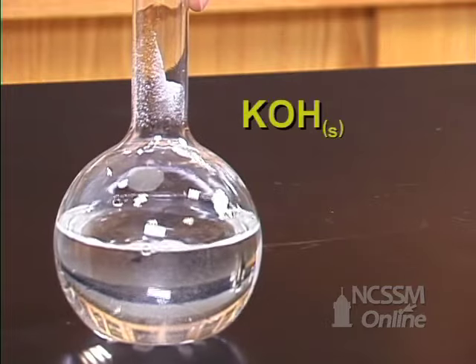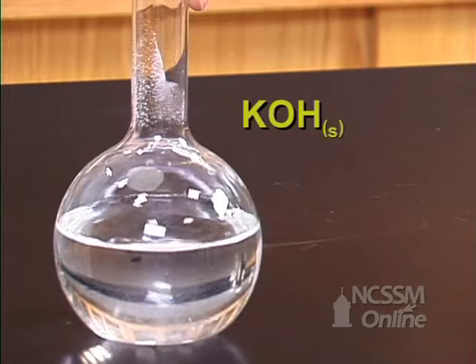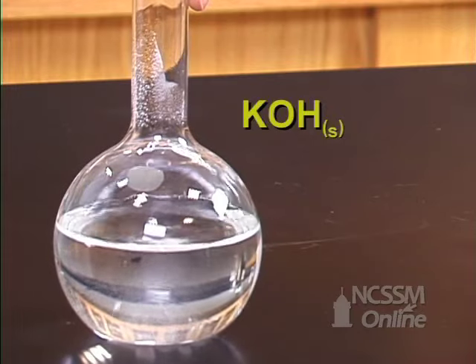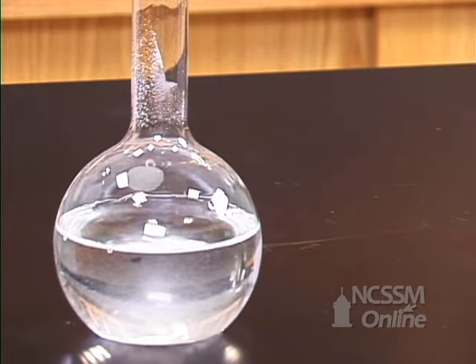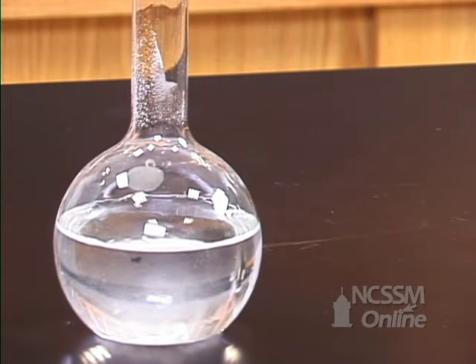If I add some potassium hydroxide, the potassium hydroxide acts as a catalyst to speed up the rate in which the glucose reacts with the oxygen in the air.